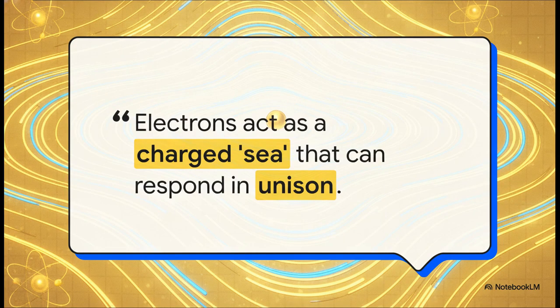To really understand this technology, we have to start way down at the atomic level, right at the surface of a remarkably thin gold film. As you can see from this beautifully phrased quote, the electrons in gold simply aren't locked down. They actually float freely, acting as a negatively charged sea. So when light hits this metal under very specific, precise conditions, it disturbs these electrons, creating a local charge imbalance. It's a lot like dropping a stone into a perfectly still pond, causing waves of electrons to literally move in perfect unison with the incoming waves of light.